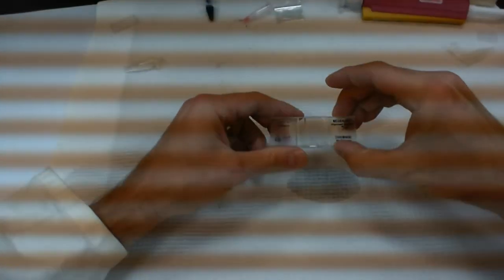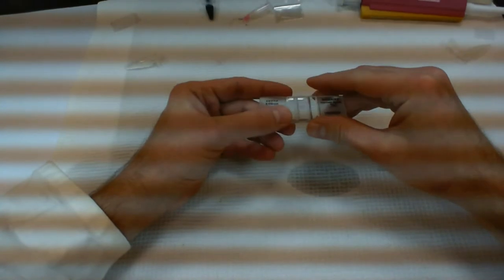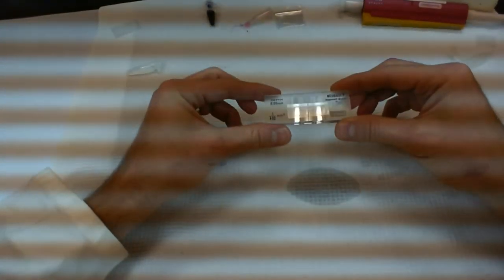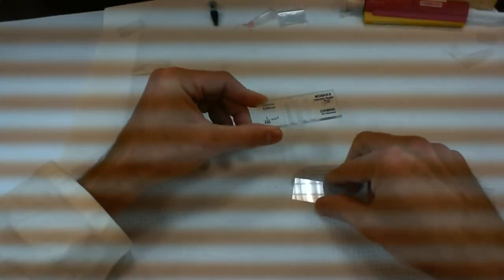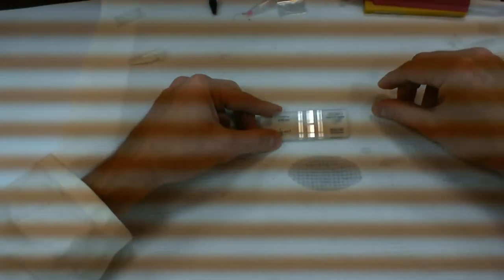But again, if all you do is just put the cover slip on top of the counting chamber, just on top of the shoulders, it's not good enough. This is not going to allow you to apply your sample. The reason I know this is because if I do this, there's no more cover slip on here. The cover slip is actually down here. So you need to make sure that your cover slip is attached to your counting chamber.